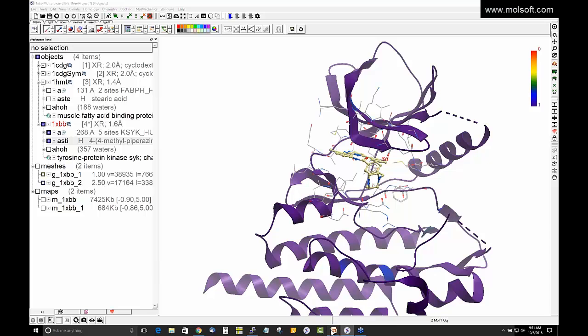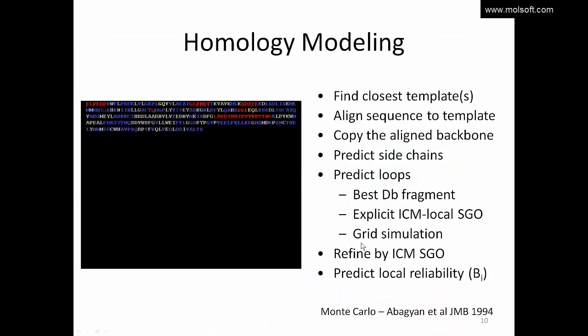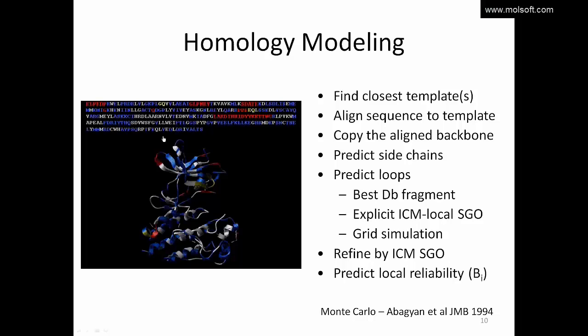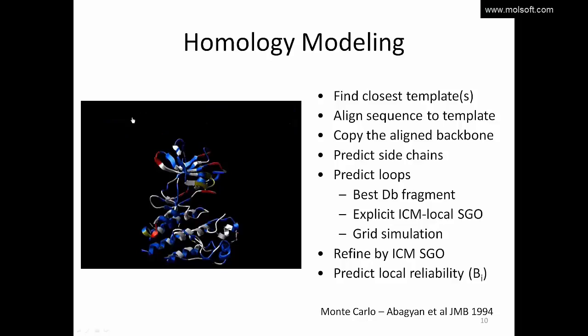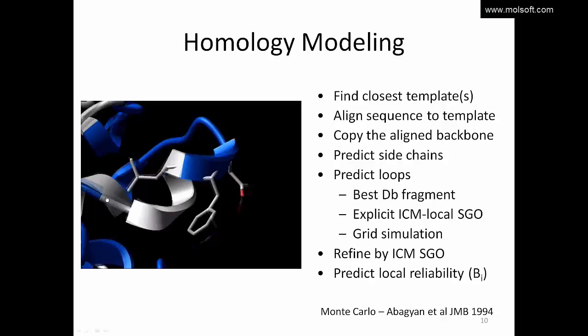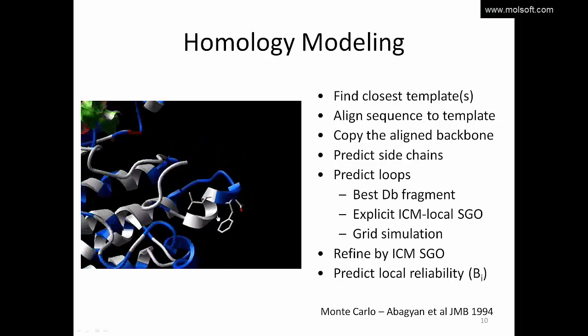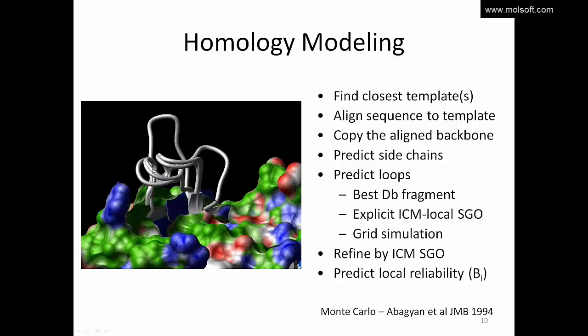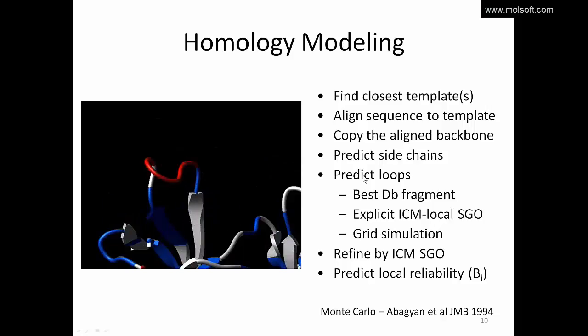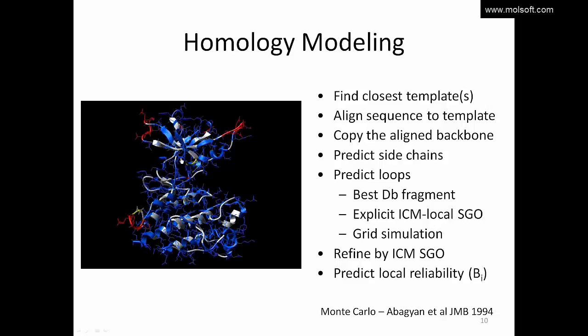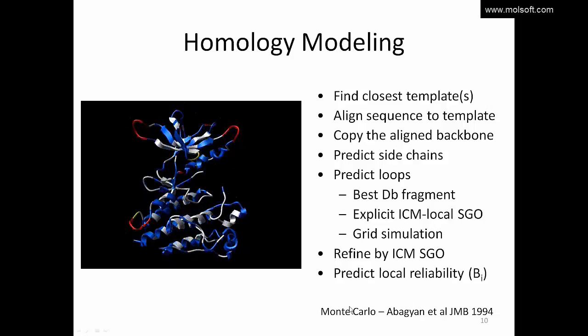Now we're going to move on to homology modeling. In homology modeling, you have a query sequence, go to the PDB to find the closest template structure, align the sequences to the template, and copy the aligned backbone atoms. Then you predict side chain conformations. The most challenging part is regions with no good homology, such as loops. Once you have your model, you refine it and fix regions with clashes or poor geometry. In ICM we use the method called ICM Bias Probability Monte Carlo, described in a paper by Ruben Abagyan and Max Totchoff at MolSoft.